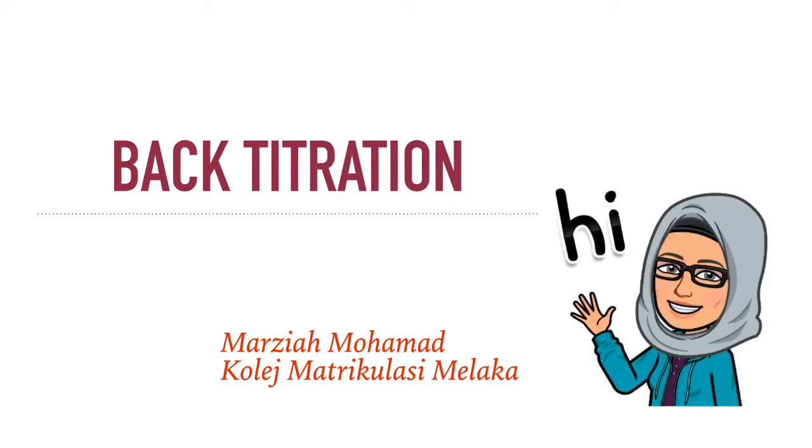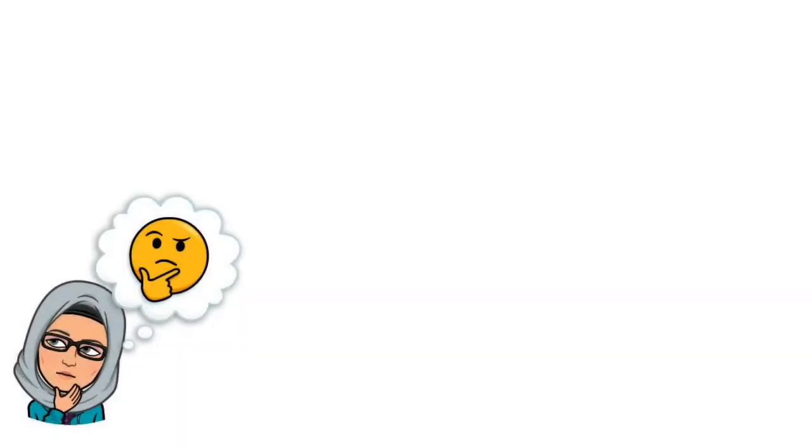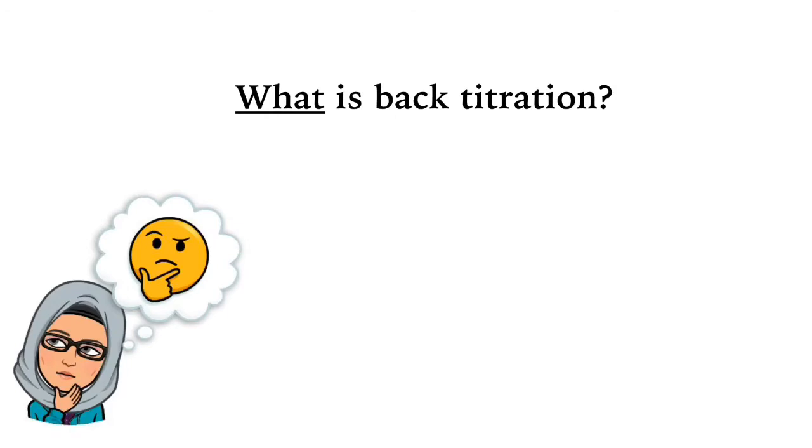Back titration is our third experiment based on the SDS syllabus for Chemistry 1. Thus, what is a back titration? What is the difference between back titration and our regular titration? In this video, we will differentiate between them.